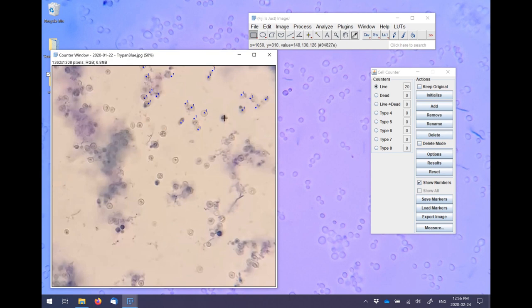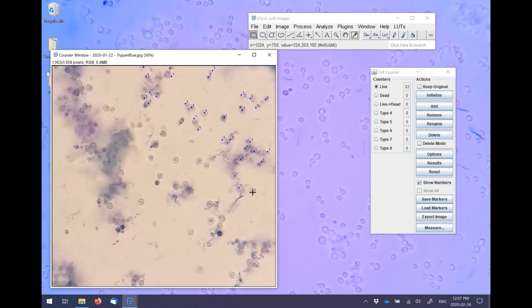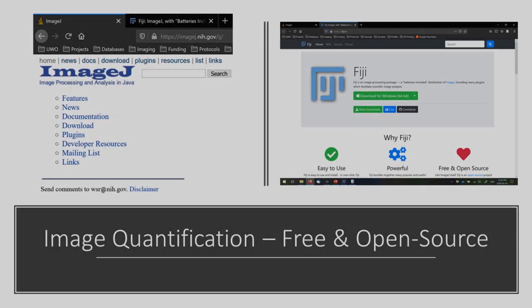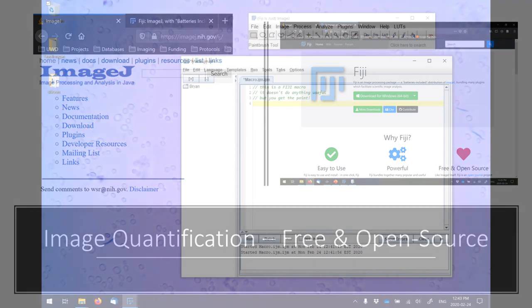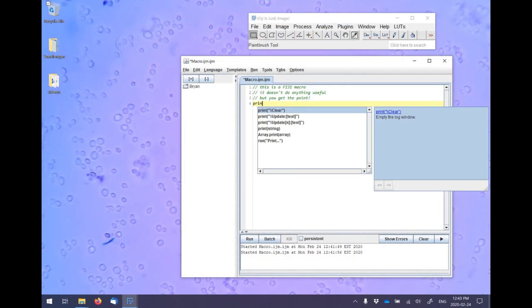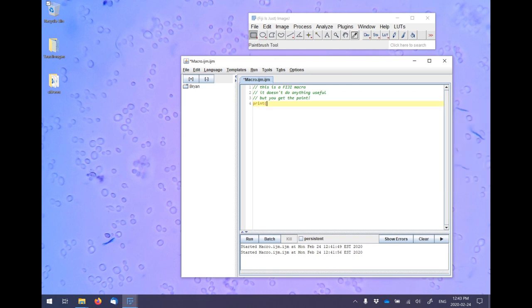Now, there's a lot of things you can do with digital images, but probably the most useful application is performing more rigorous cell counts. This is particularly useful if you're dealing with a mixed fermentation where you're trying to count the numbers of individual types of organisms within a sample. These types of counts, as well as many other forms of image analysis, can be performed in Fiji, a free scientific image processing package. This package has many plugins which allow for a broad range of image analysis procedures to be performed. It's even scriptable to allow for semi-automated image analysis.